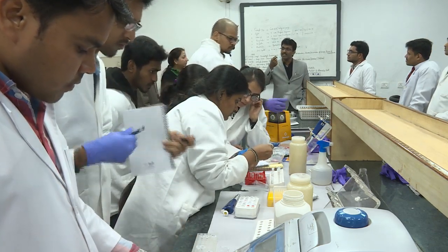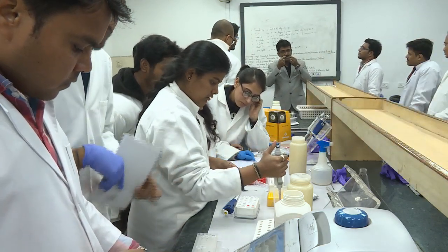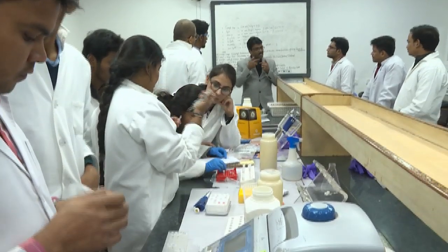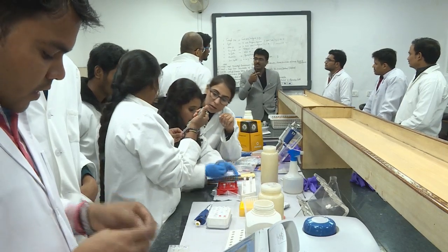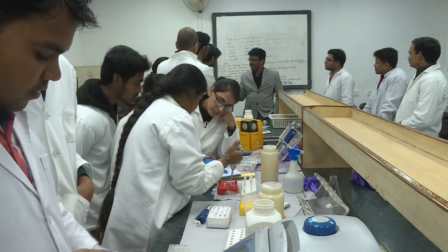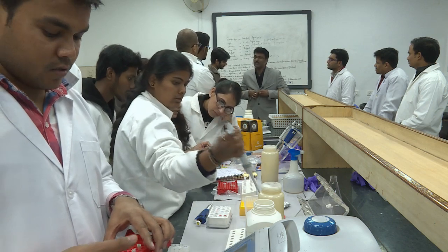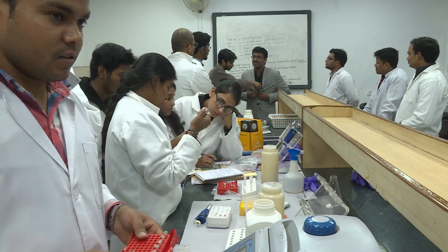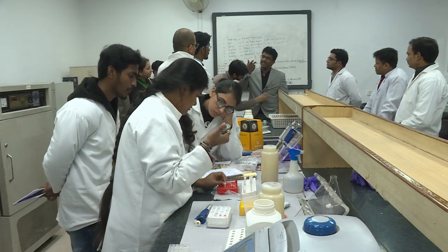With the machine. We have a handheld machine. You put the vessel in the front, just press it, goes around 5,000. You should then just continuously grind it for about 5 minutes.